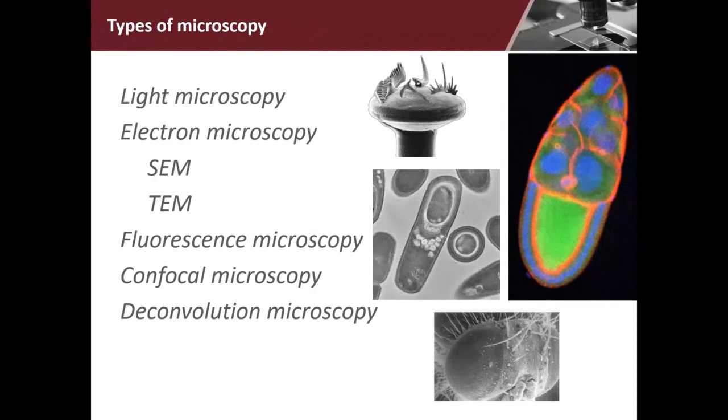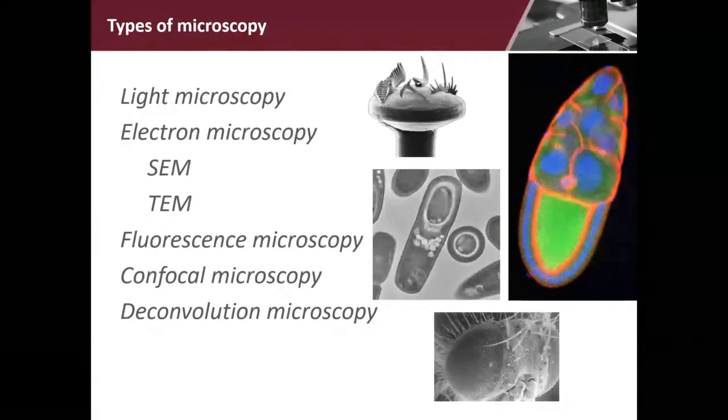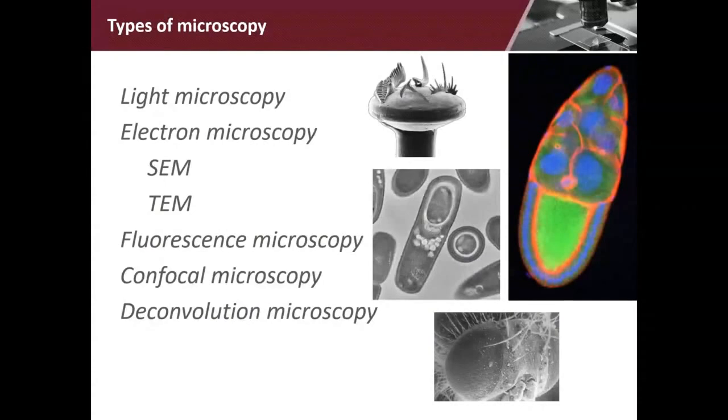And then there's microscopes that are connected to computer programs that allow you to take images of slices of a cell, not slices, planes, so it'll go through all the planes of the cell, and then the computer will regenerate it and make it look three-dimensional. So we are only touching just a little part of microscopy when we're using a light microscope.